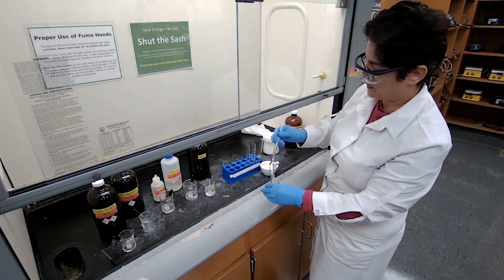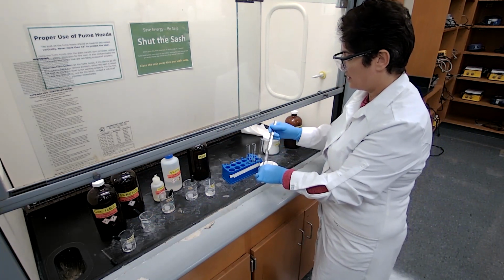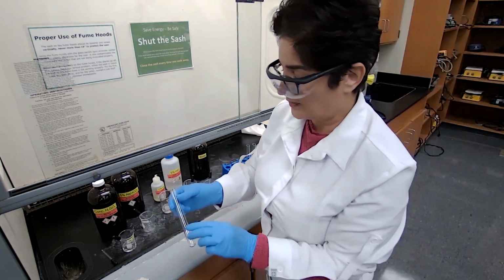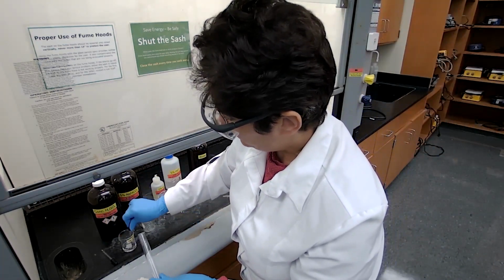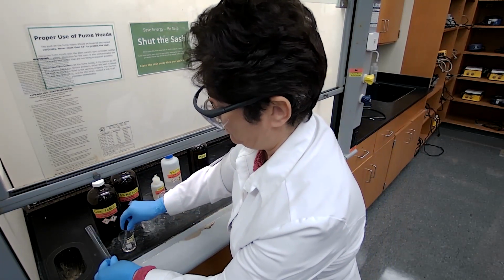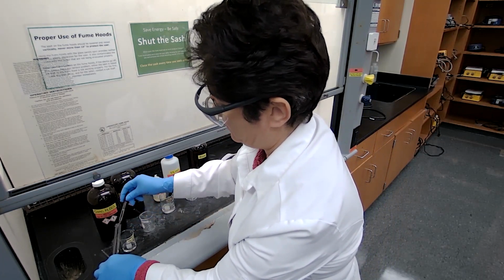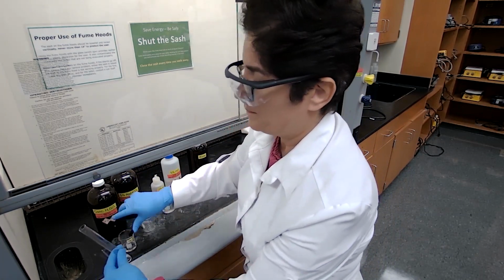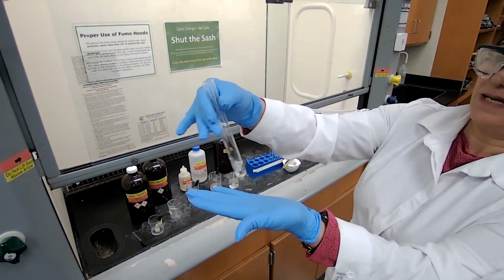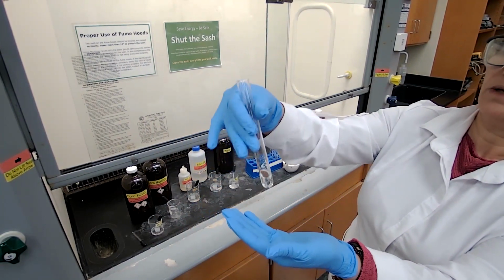We're going to see if the sample is going to dissolve or react with the sulfuric acid. I'm going to mix it for 10 seconds and check the appearance.